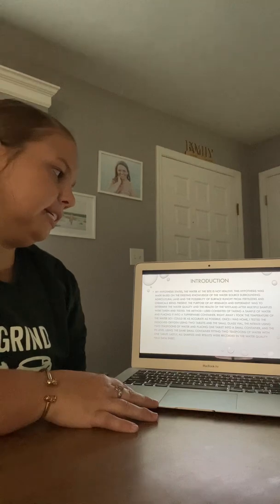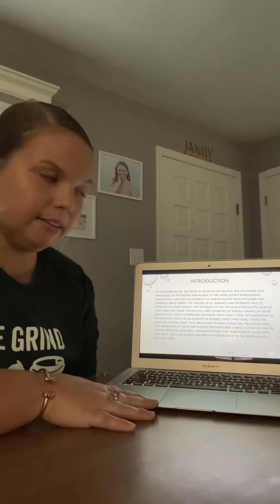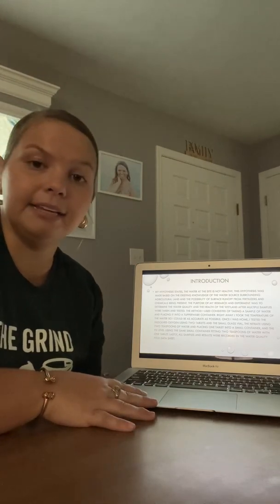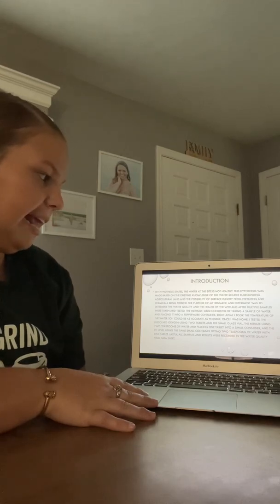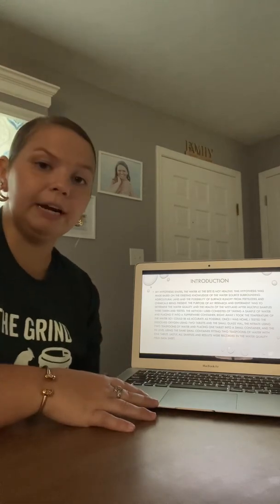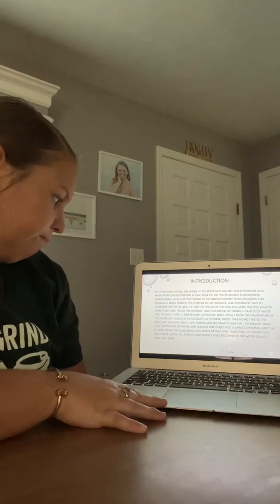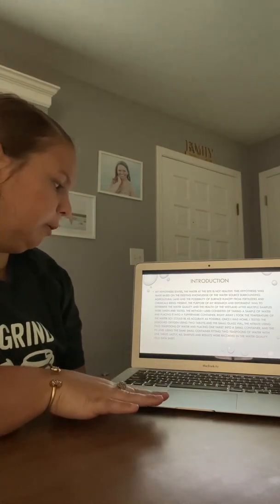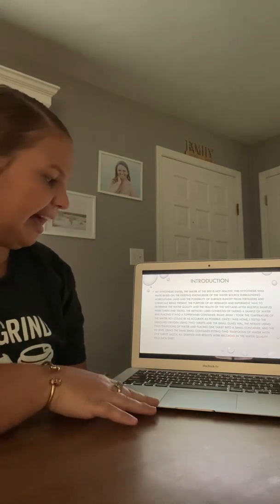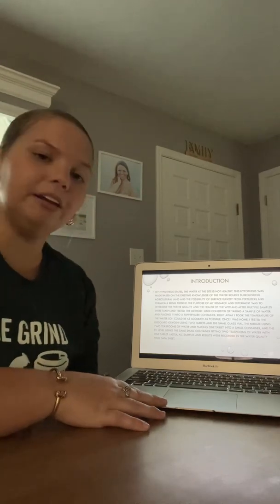The method I used consisted of taking a sample of water and placing it into a Tupperware container. Right away, I took the temperature because I wanted it to be as accurate as possible. Once I was home, I tested the dissolved oxygen using 2 tablets in the small glass vial. I tested the nitrate using 2 teaspoons of water and placing one of the nitrate tablets into the small container. And I tested the pH using the same small container, fitting 2 more teaspoons of water with 1 pH tablet. Lastly, all samples and results were recorded in the water quality field data sheet.